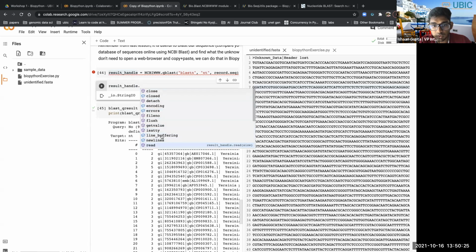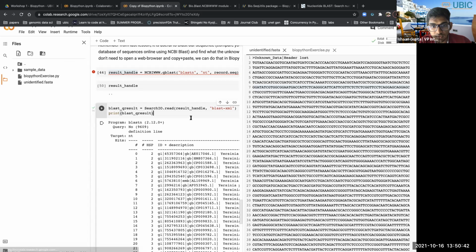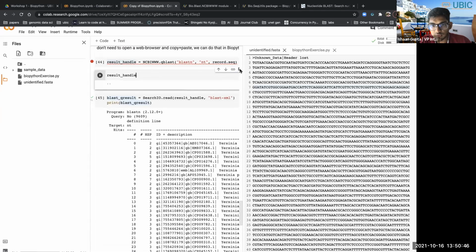You could try to do this. We can try to read it, maybe till the first 100 characters even. Oh, doesn't give me anything. Yeah, okay, that's a bad move, by the way. Let's just go with it. Don't do what I did here. I was just exploring.